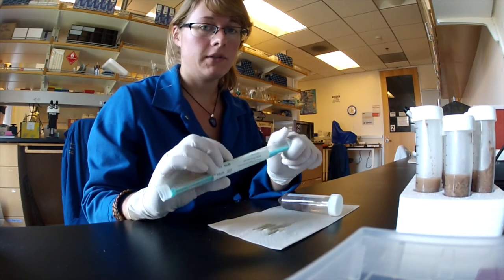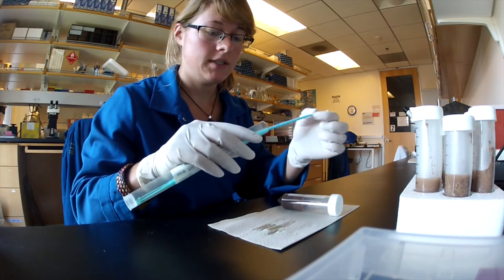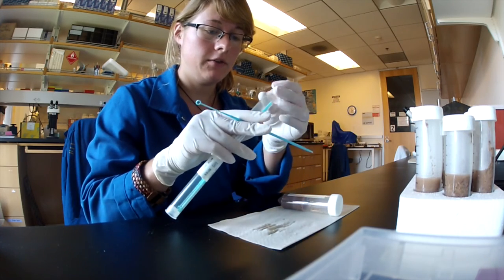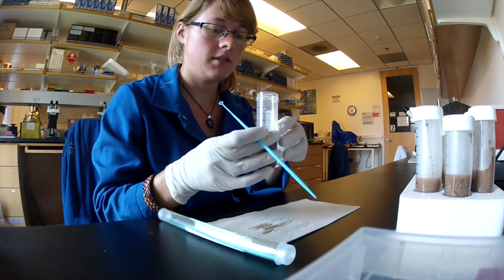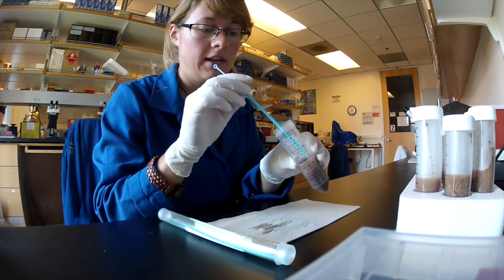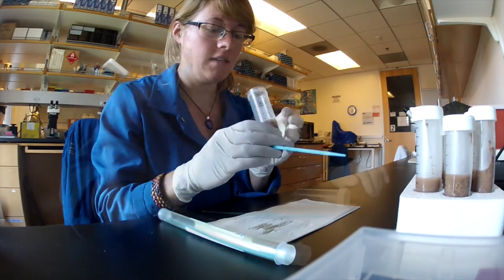To make it easier for the beetles to burrow into the diet, use a sterile probe such as disposable inoculating loops or a flamed instrument and score the surface of the diet. I like to poke holes to make it easy for them to dig in.